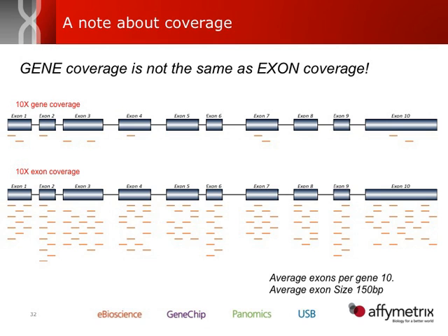But the difference here is if we talk about 10x exon coverage, and we're focusing a lot on exon because, again, the alternative splicing, looking at those differentially expressed isoforms, is where a lot of the interesting biology is happening. So if you want to get exon-level information, if you need 10x coverage, that means you need to hit each exon 10 times. So look at the depth of coverage or the amount of reads that you need to get 10x exon coverage versus 10x gene coverage. It's quite a bit more.